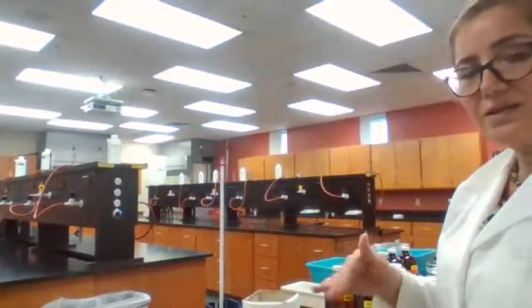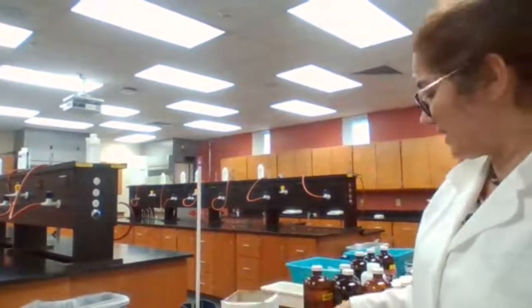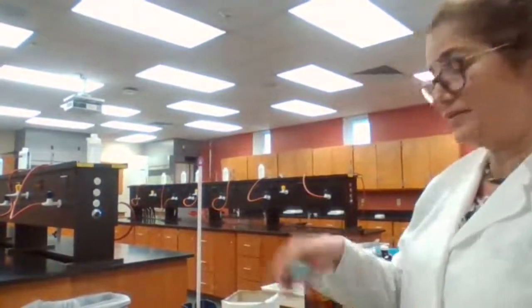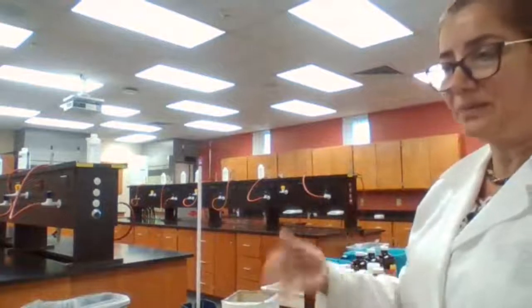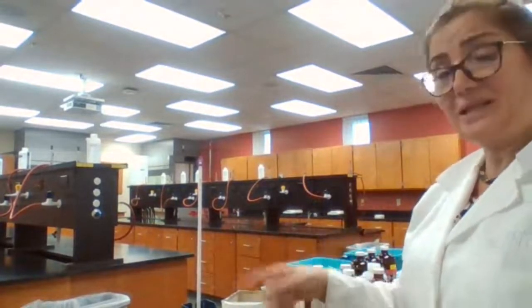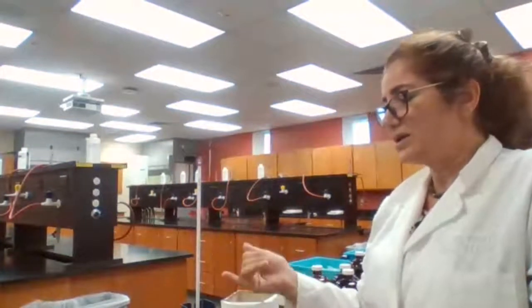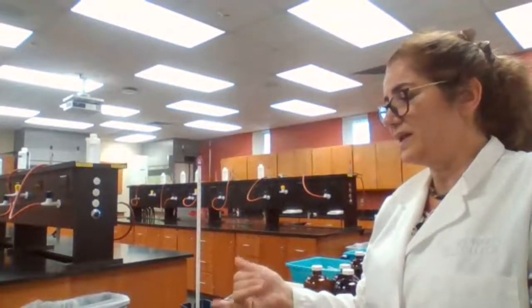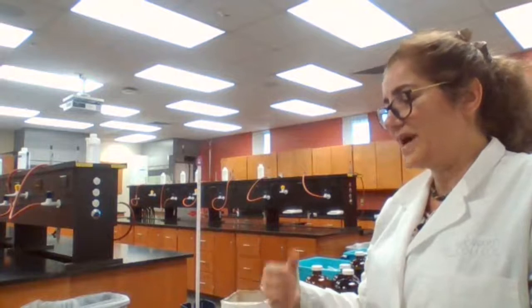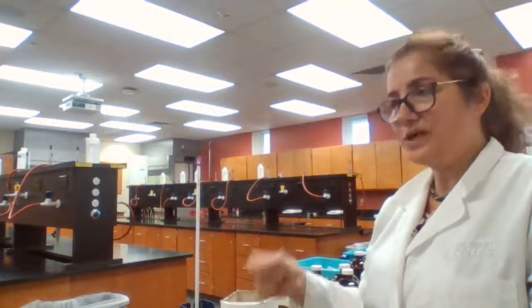You cannot reuse that sample. For the melting point of an organic compound, you have to make a new sample again. You cannot reuse the sample because you heated it up. It can decompose at high temperature because we don't know how high it was melted. So we have to prepare a fresh sample.